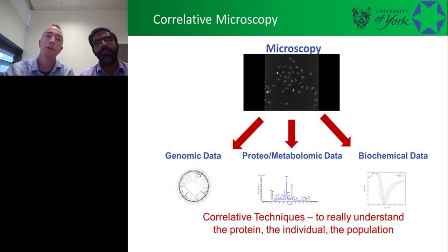You've got some other great talks from other speakers looking at phase imaging. Take those images. Let's start coupling those to other technologies that are out there today. Because actually microscopy is at the forefront of the next revolution of transcriptomics, metabolomics, proteomics. It will get there once we get the sensitivity.